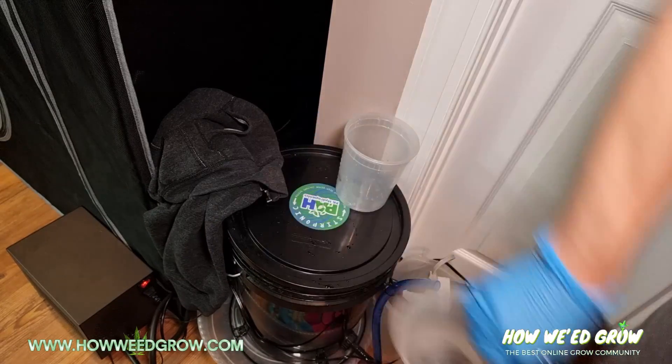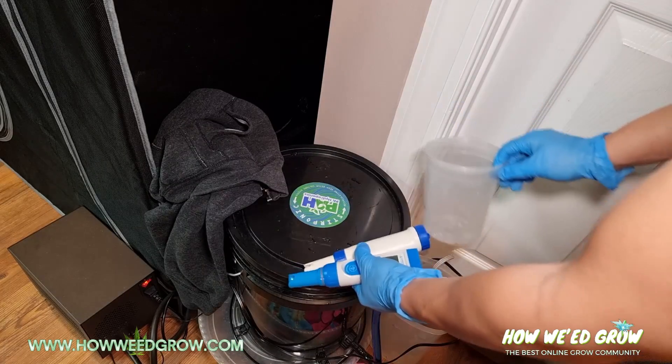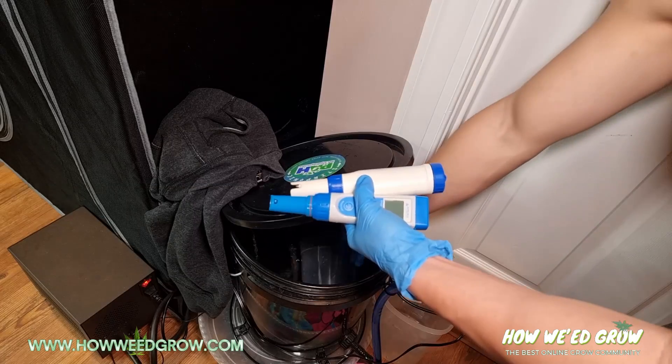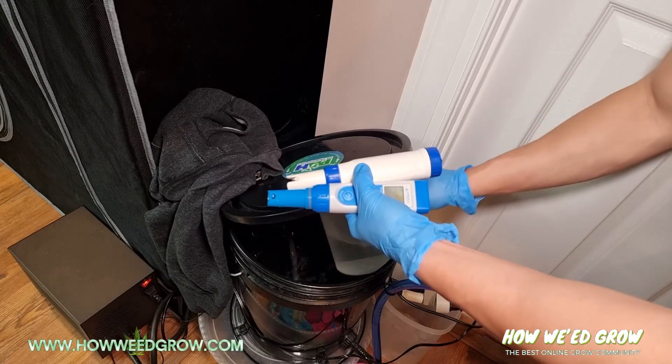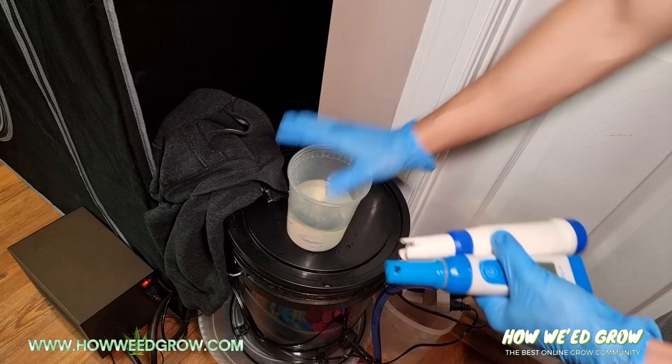Now I'm going to go into my reservoir and get some of the water that I want to measure. You don't need a lot — you just need enough to fully submerge the probes.